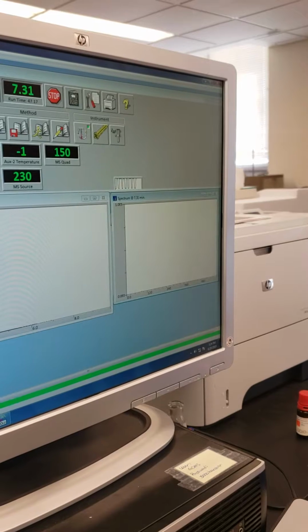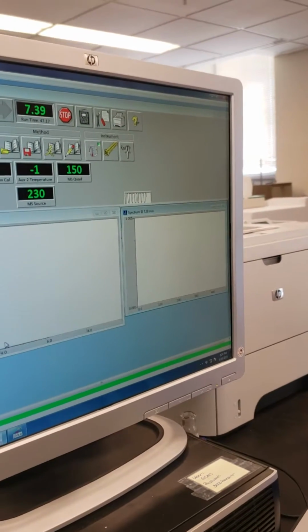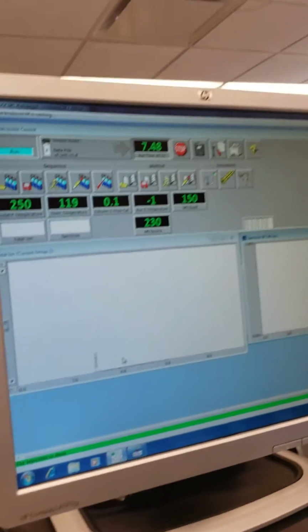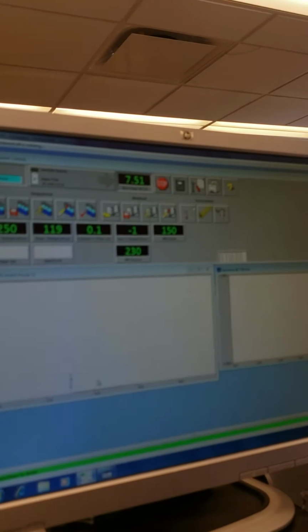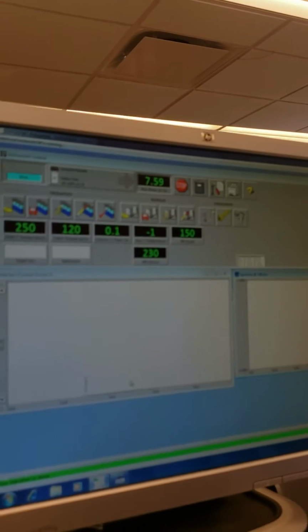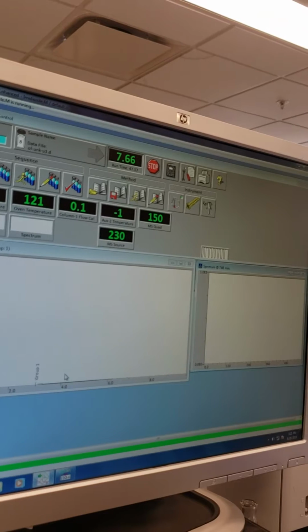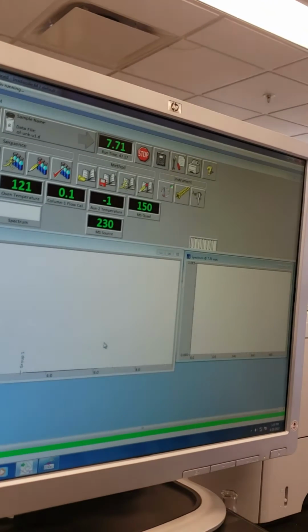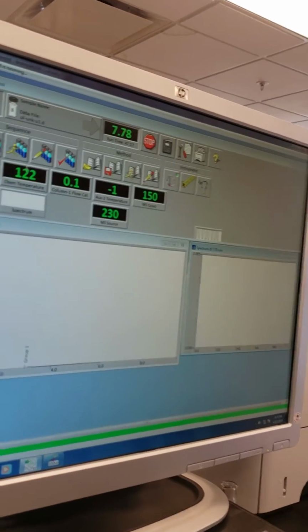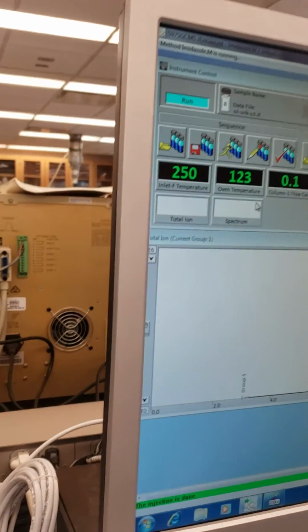But I think it will be fine because that compound is not very volatile. I think it will come out at maybe about 50 or 60 degrees. Well, no, the melting point was 40 degrees, so maybe it volatilizes above 100. So I don't think it will come out yet. And where can we see the temperature at the time? Okay.